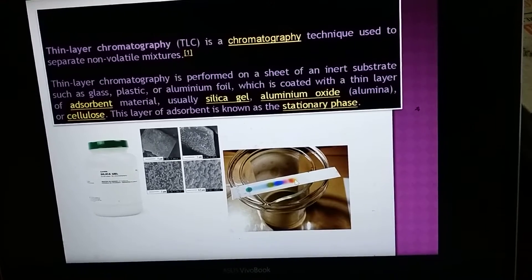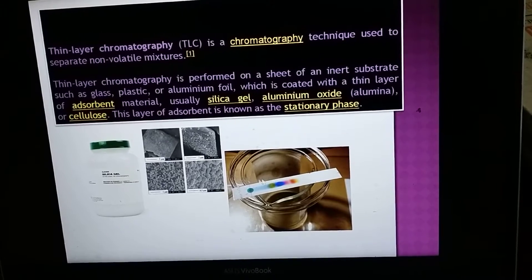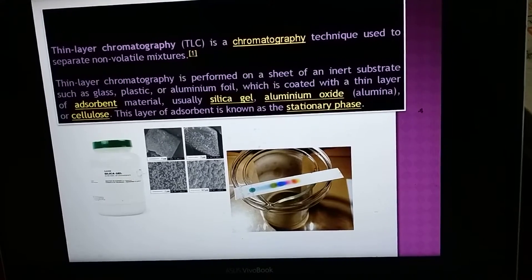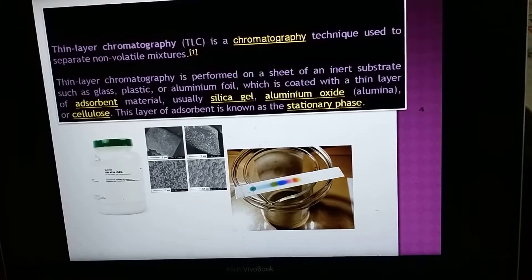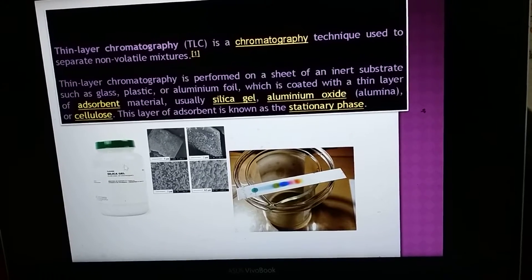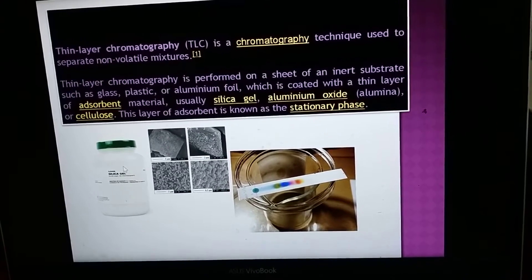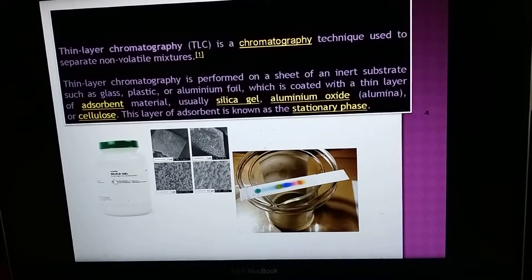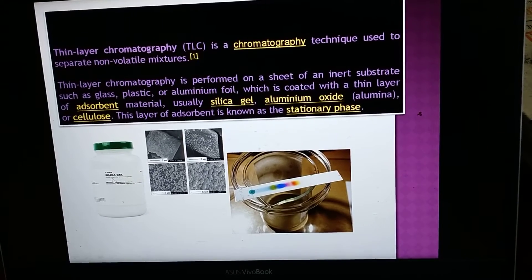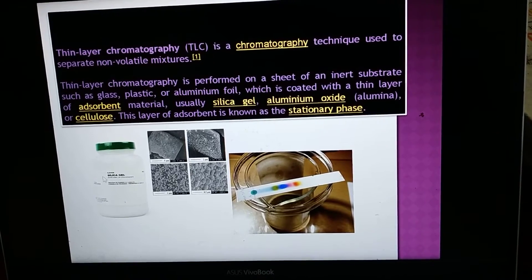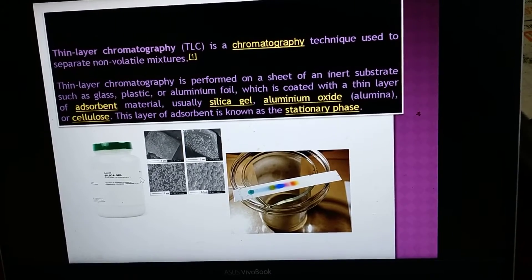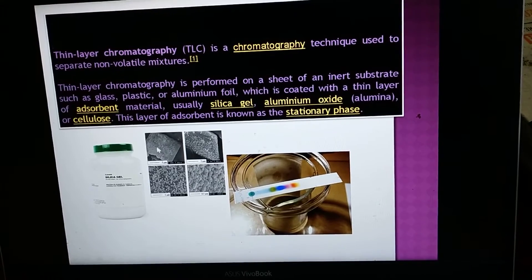In biochemistry, several types of TLC are used, but in organic chemistry you will mainly find silica gel. This is the box of silica gel powder — it is a dry powder. Different sizes of silica gel are present from several industries, and the size is measured in mesh — it may be 200 mesh, 160 mesh, 260 mesh, or 300 mesh.